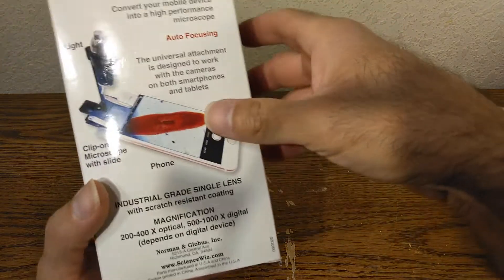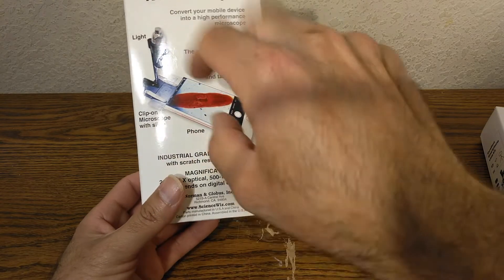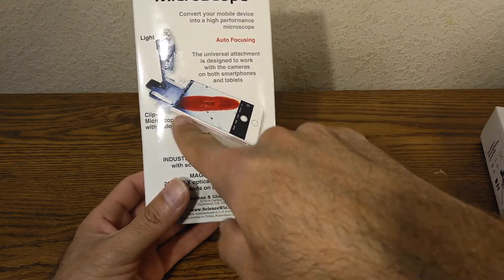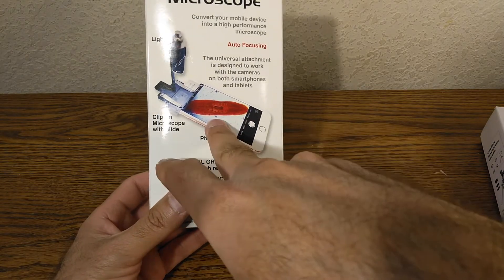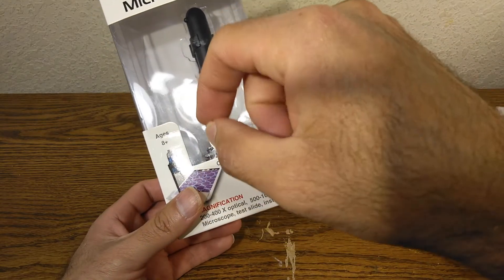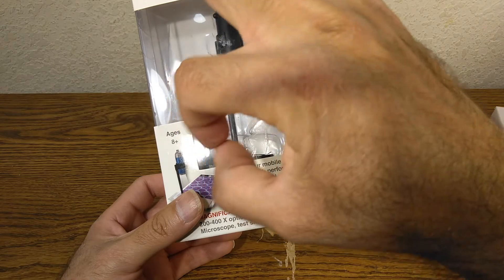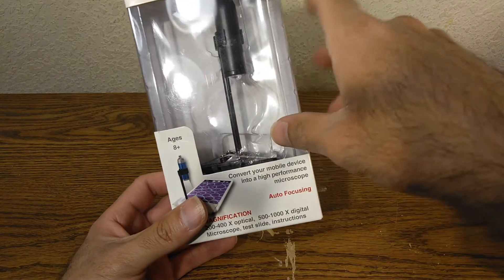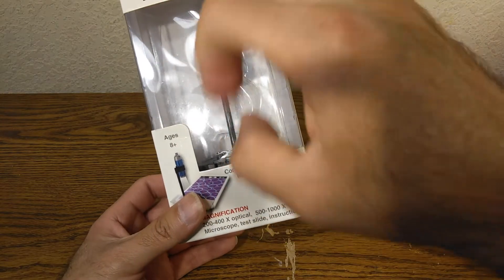For this to work, you can buy anything from Amazon or eBay — like slides — but they have to be transparent, and the ones on Amazon and eBay are transparent. Anything that doesn't transfer light, you're only going to see the silhouette, only see the shadow. Which is still fun, but it's more fun when you can see all the details.